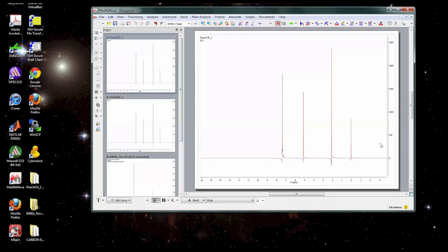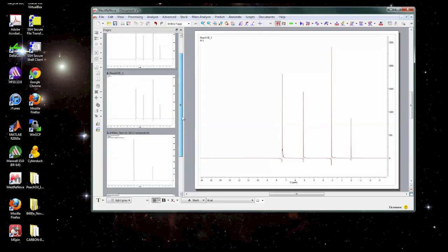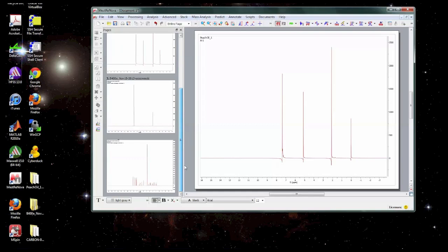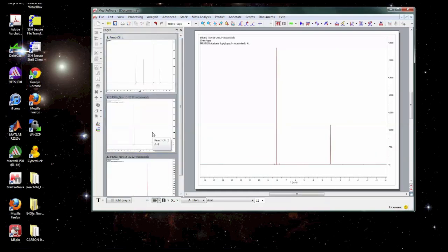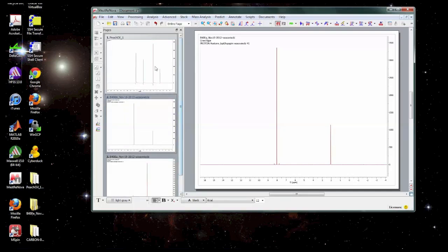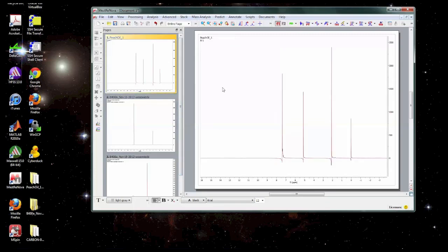Okay so we're just going to focus on this first spectrum right here. I'm going to for now just leave the other ones alone. I'll get rid of this one by highlighting it and selecting delete and remove it from the document but it doesn't delete the data from the computer. Okay so looking at this first one we're going to go through the basics of processing and basically you want to start at the left hand side of this toolbar here and then move to the right.